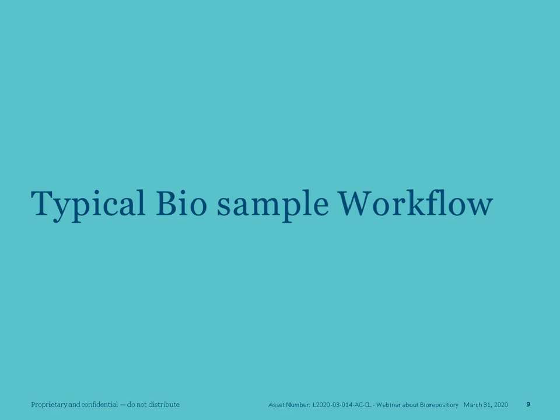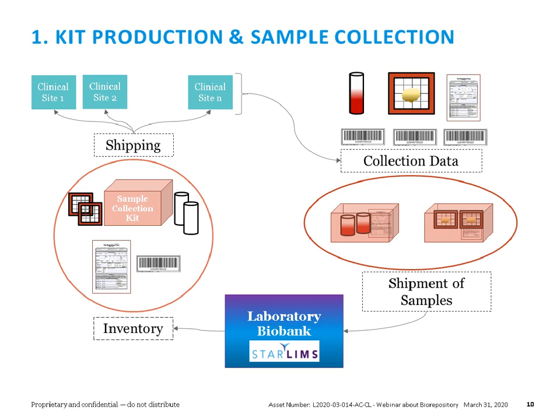So I'm going to now show you a typical biosample workflow, and this is going to be more in the context of a clinical trial and research purposes. And I think probably many of you are familiar with the concept of the kits. So kits for sample collection. This is something that many labs do offer, this feature of kit production. So they have the need to prepare these kits. So the kits are going to be basically considered a kind of consumable. It's just a material. And for purposes of keeping the inventory of that material, an inventory management solution is pretty good for that, right? Because it is just a consumable.